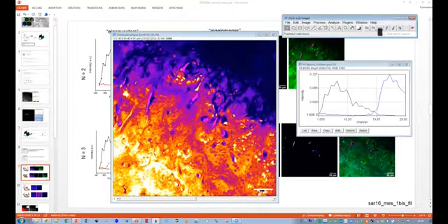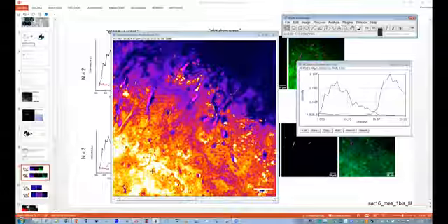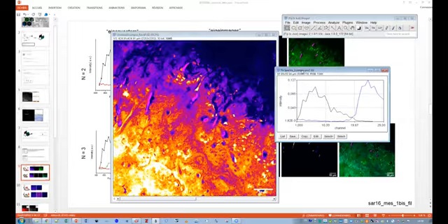Okay, so this is particular with my sample because I don't know if I have pure components. I mean, even this eigenvector is maybe already a mix of different components. But with labeled cells, it works perfectly because it's really characteristic of a fluorescence signature.